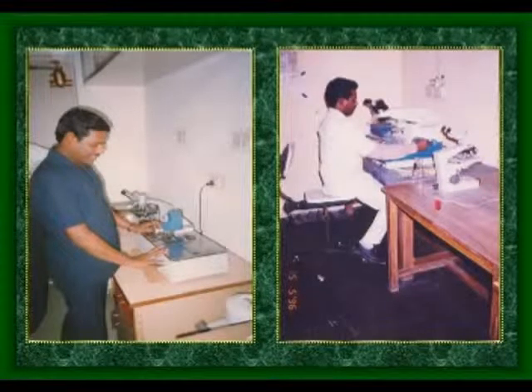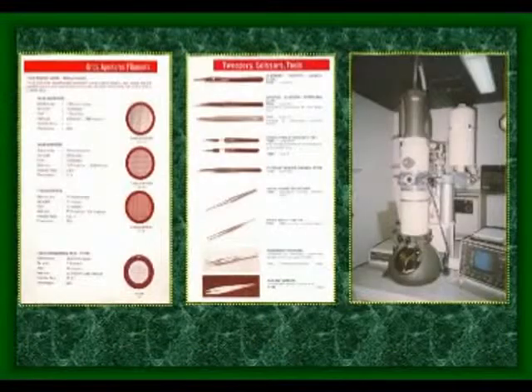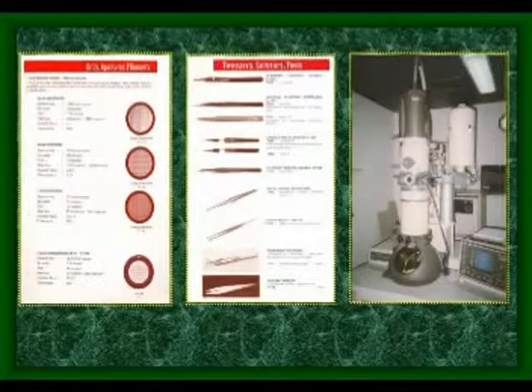The sections come out in different colors. The colors range from grey, silver, gold, yellow, orange, purple, green. So these colors indicate thickness, each and every color recognized as a 20 nanometer range. In electron microscopic studies, generally 60 to 90 nanometer sections are very good sections. So we have to collect silver, grey and gold color sections.